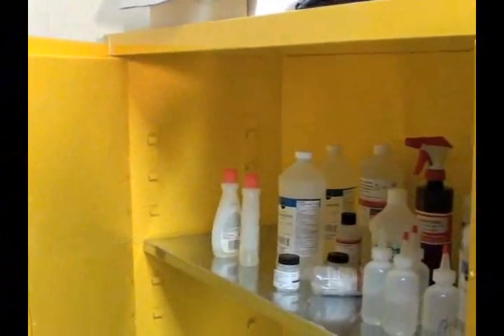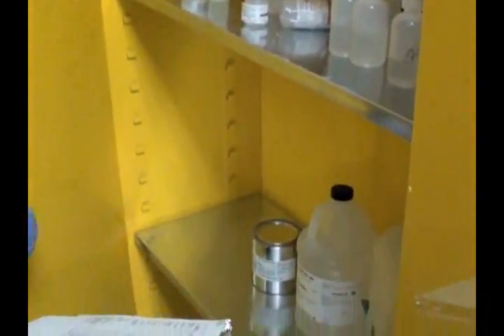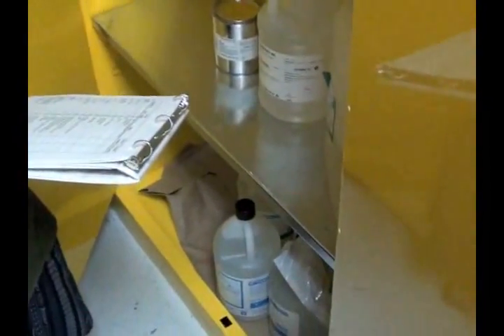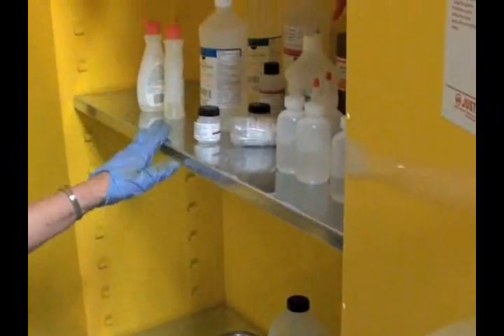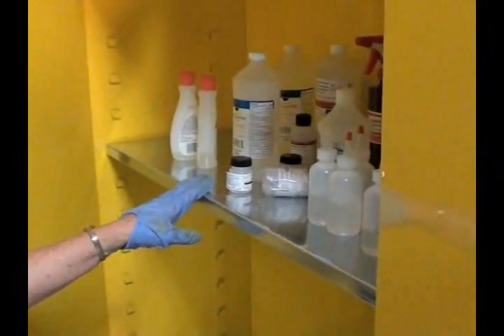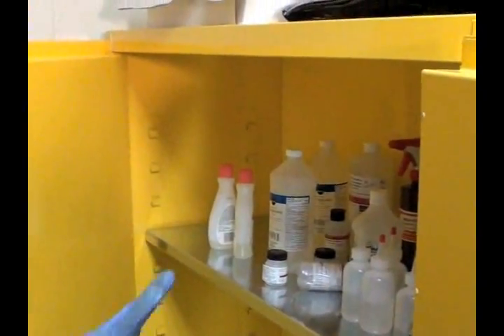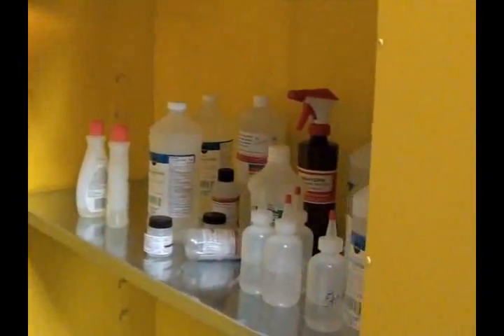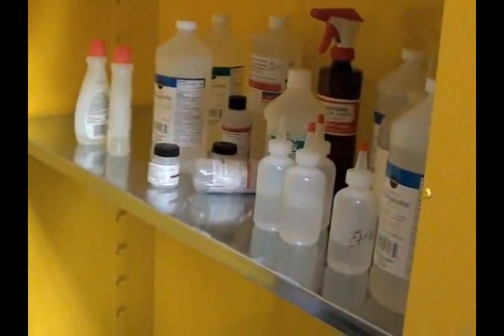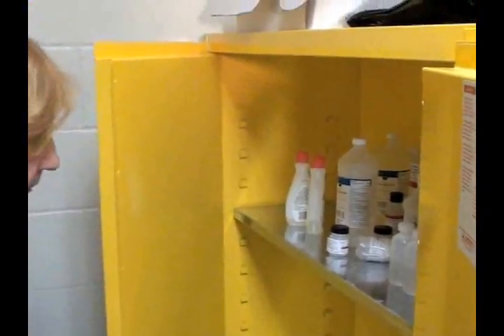But I'm looking in this cabinet and it appears to be quite new and it's in good condition. Now if it's rust, these little things will rust away and the shelves will collapse. This has happened. That's a very serious situation. But just take a good pre-look and see if you see anything that looks suspicious. And there's not in this particular cabinet. It looks as though everything is pretty new.